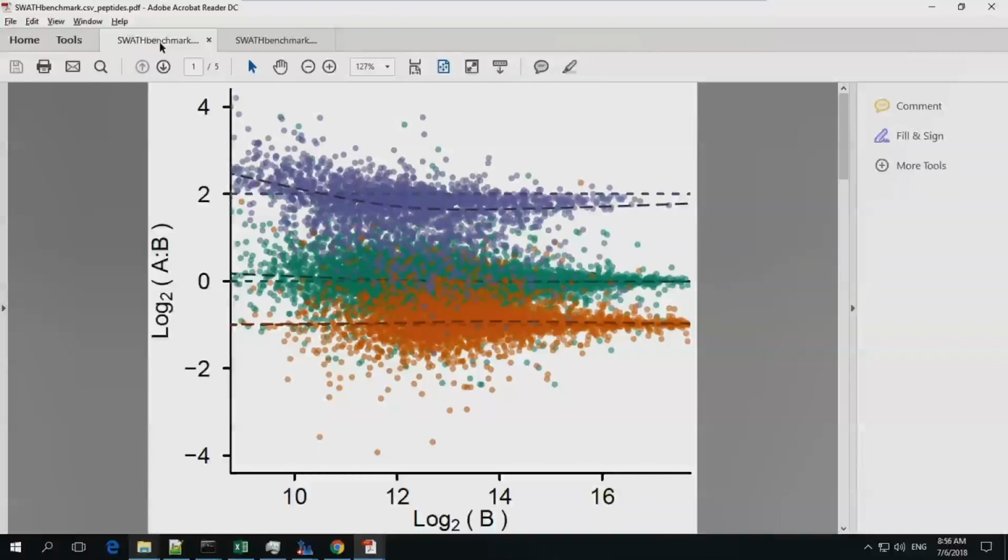So the actual results, the expected value is more extreme than what we're seeing, right? So we're not quite seeing fourfold. I mean, we have this curvature at the end that, you know, curved lines and, you know, I don't know, but so is there any reason why our data would just produce that?